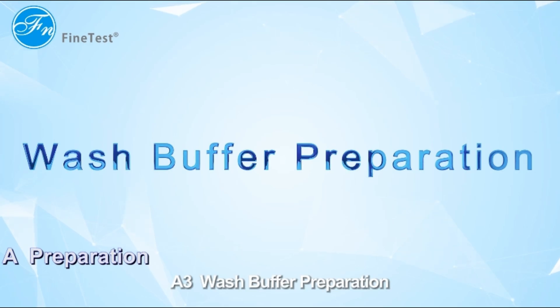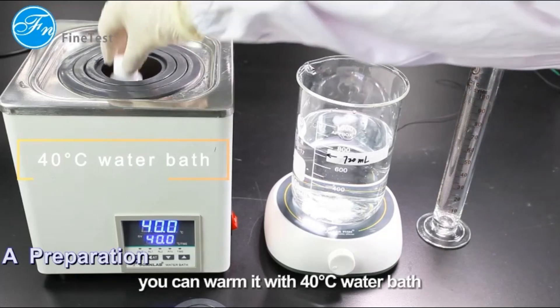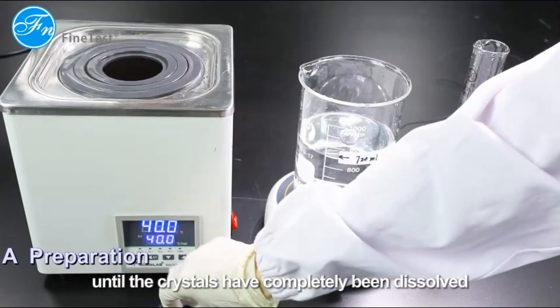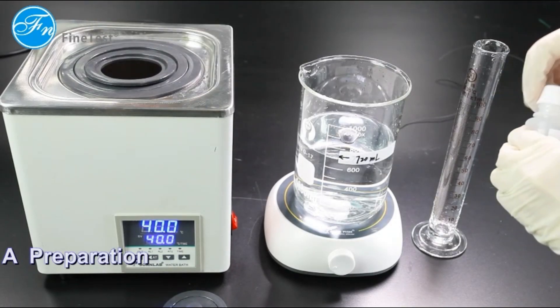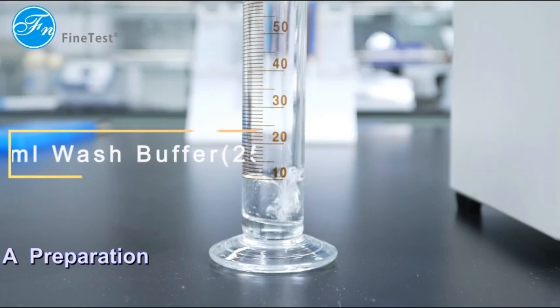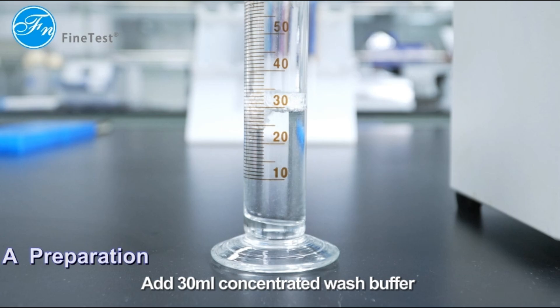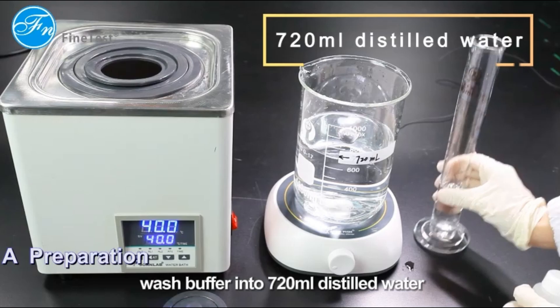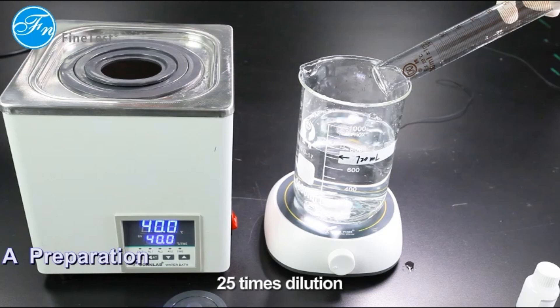Wash buffer preparation: if crystals are observed in the concentrated wash buffer, warm it with a 40-degree water bath not exceeding 50 degrees and mix gently until the crystals have completely dissolved. Then add 30 milliliters of concentrated wash buffer into 720 milliliters of distilled water and mix well — a 25 times dilution.